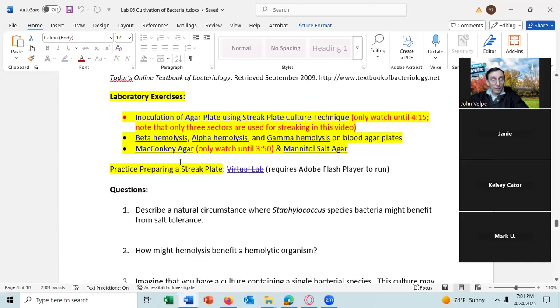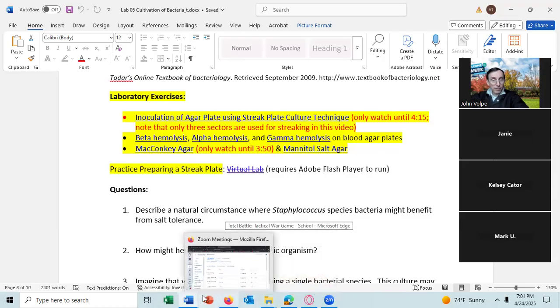And then there's a video talking about MacConkey's agar. You only need to watch that video to 3 minutes and 50 seconds into the video. And then a video talking about mannitol salt agar. You should watch that video. Any question about any of that? Let me go to the worksheet now.